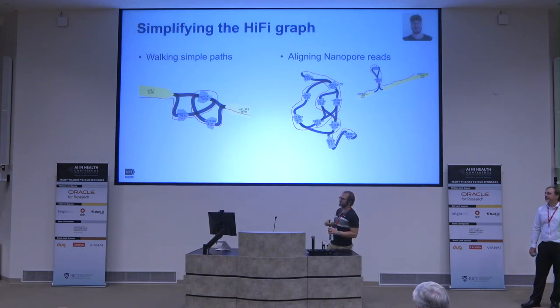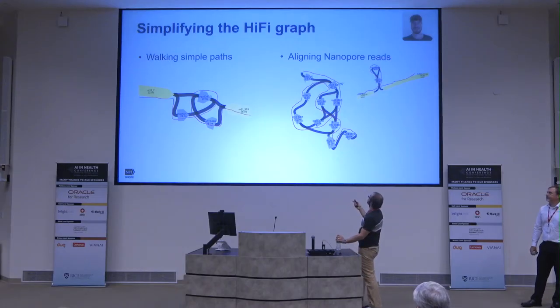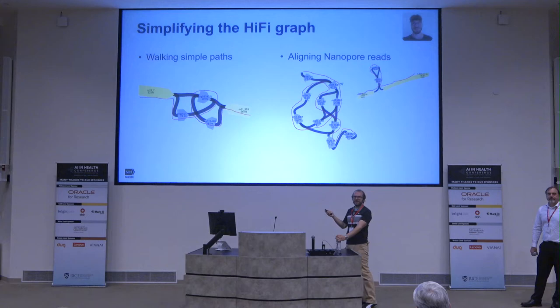The first one is just a Hamiltonian path, because if you constrain that you have to use every node once, there's only one way to walk that graph. So that one is defined by the graph structure. On these, yes, what we did when we were doing this manually was we tried to make all the possible versions of this and then look at how the ONT data supports it and decide which one is better supported. The automated one does essentially that, yeah.